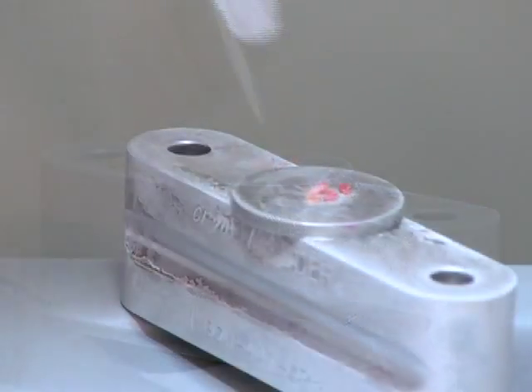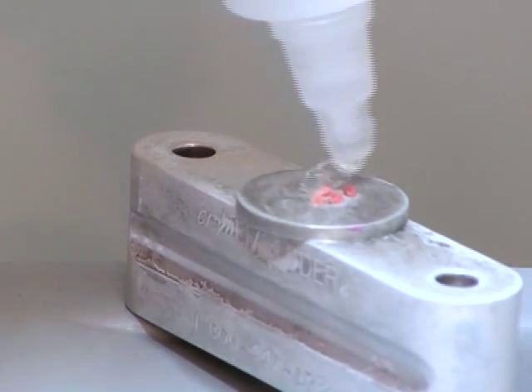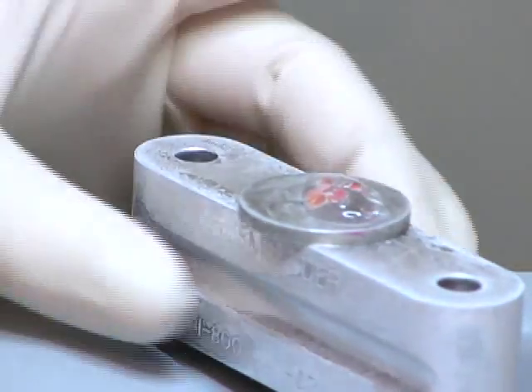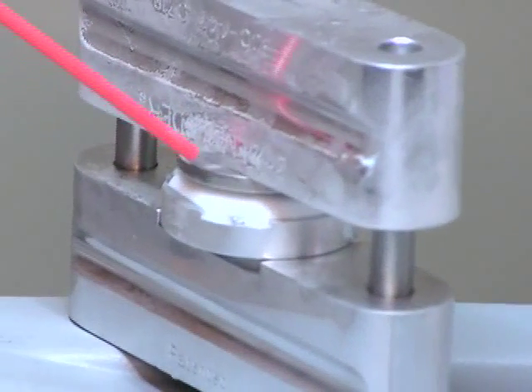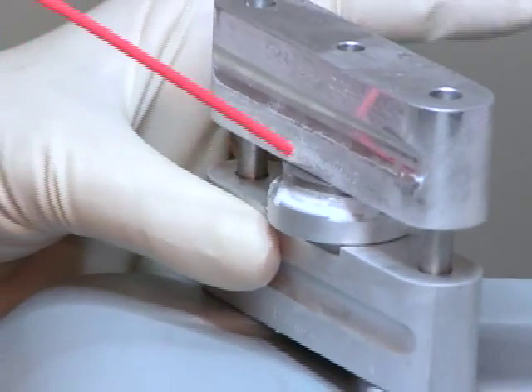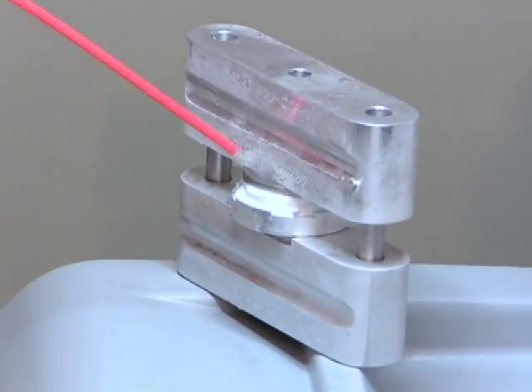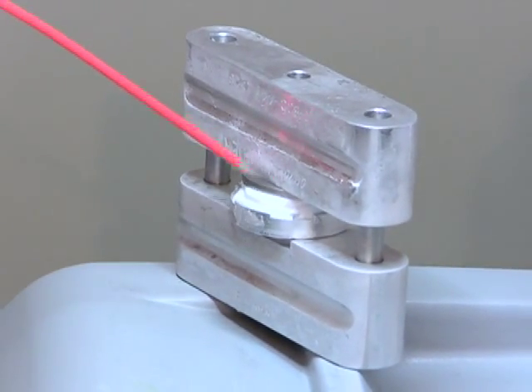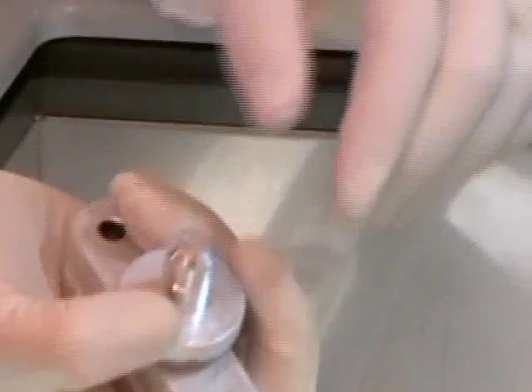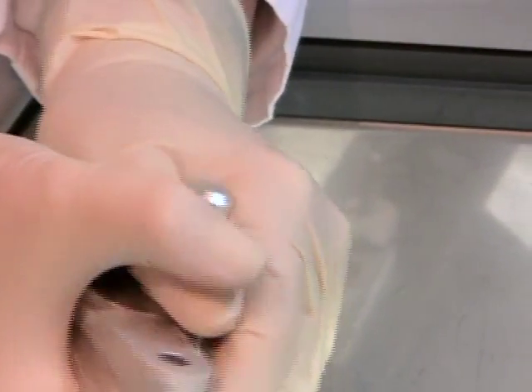This portion of the demonstration has been performed in real time to show the speed at which frozen section samples can be ready to cut. In addition to speeding up the processing time for the technician, the cryoembedder provides the pathologist with more accurate slides that will show all of the pieces in the block on the same plane in each section placed on the slide. Precious tissue is spared, multiple sections can be cut on the same plane, and slides will be ready for the pathologist faster.